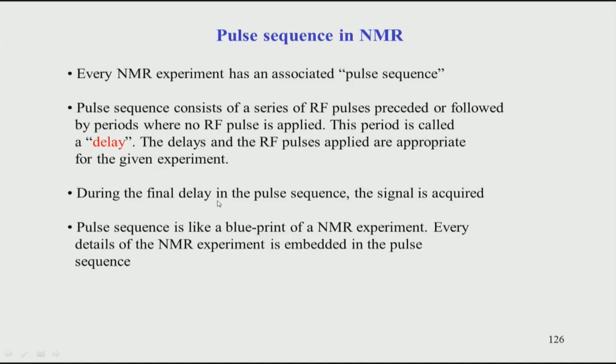Now, let us see how we actually experimentally record the NMR data. What are the practical aspects? This will be useful if you are setting up an NMR experiment on an NMR spectrometer, and therefore, you should know what the different parameters involved are and how a spectrum depends on them.